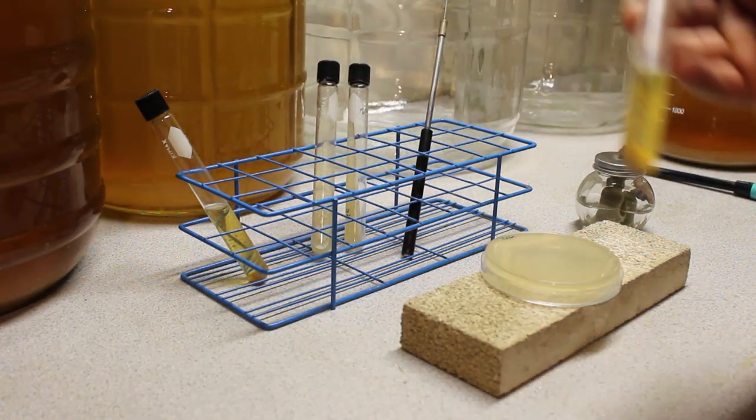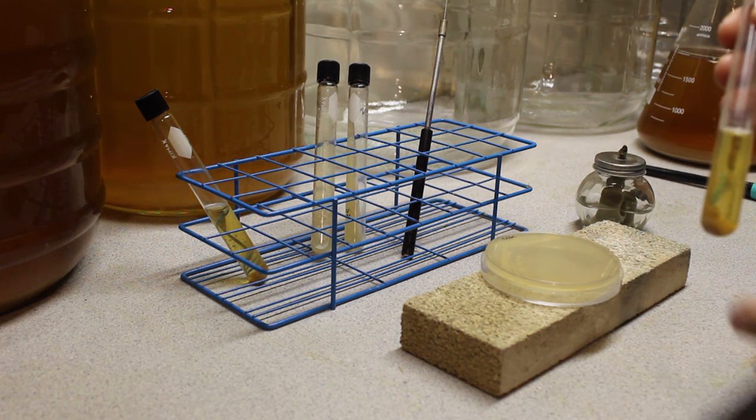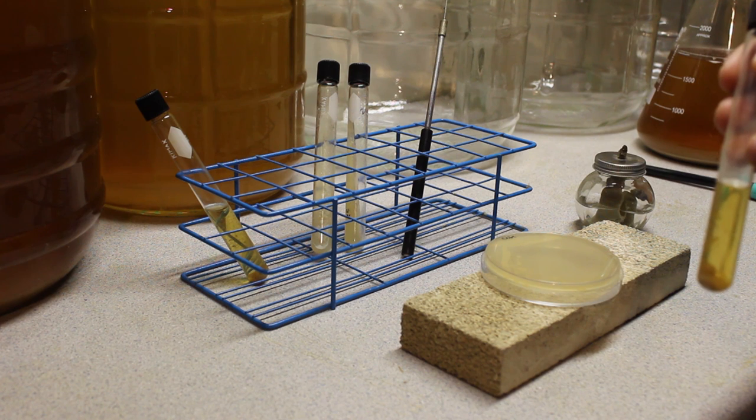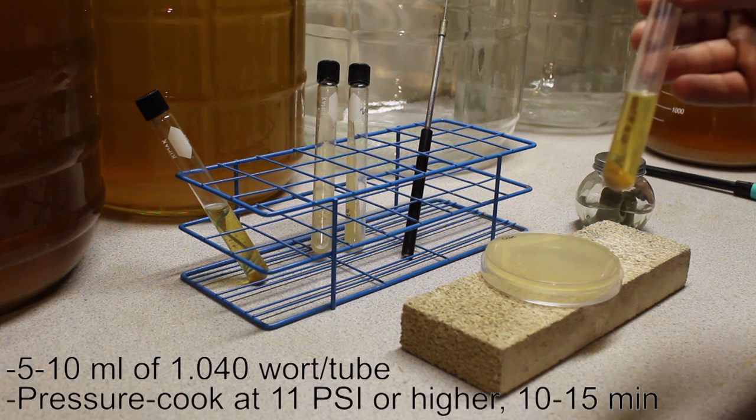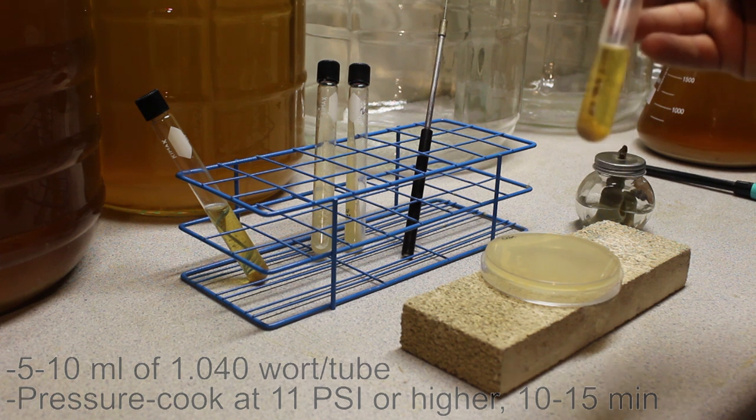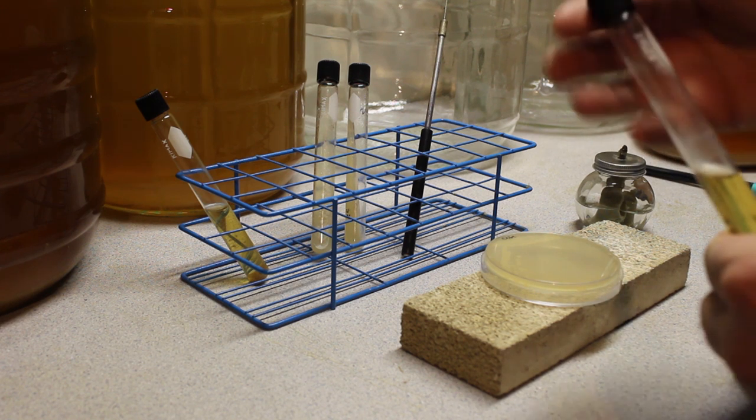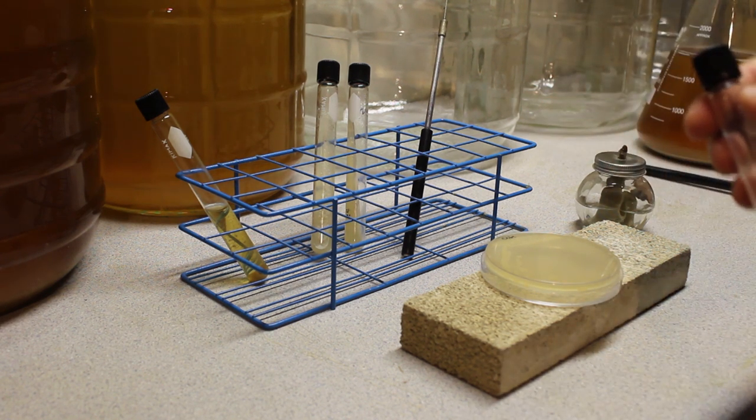Now for these tubes of wort, these are actually very simple to make. Simply make up some wort at 1.040 gravity, fill the tubes about halfway and run them through your pressure cooker or your Instapot at a high canning pressure for about 10 to 15 minutes and that'll sterilize these completely. You will get some protein precipitate but this is harmless, and these can then be stored pretty much indefinitely as long as you keep those caps on nice and tight.